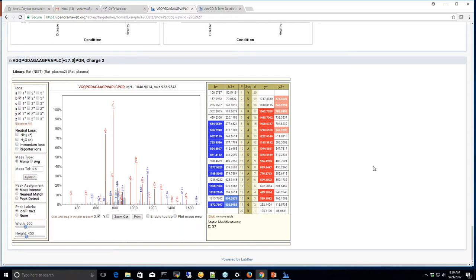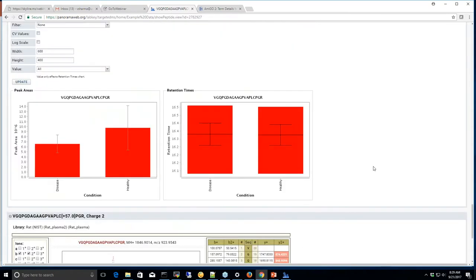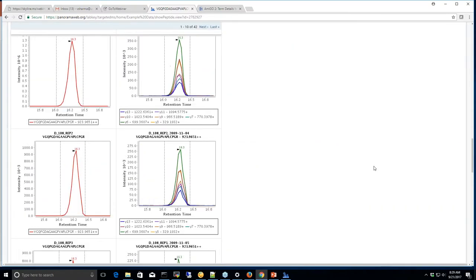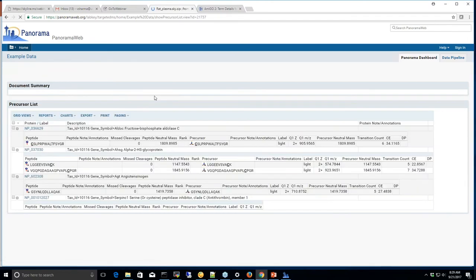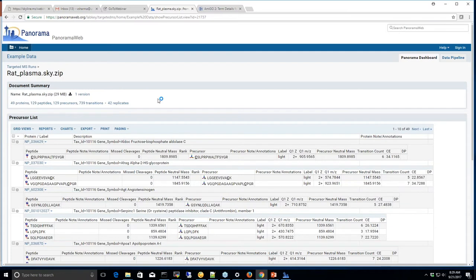Below the summary charts is an annotated MS/MS spectrum. If your document is associated with a spectrum library and there's a matching spectrum for the peptide you're looking at, you will see this interactive spectrum viewer in which you can zoom in, zoom out, and select which fragment ions you want to show or hide. I'm going to go back to my document details page by clicking on the file name right above the peptide sequence.